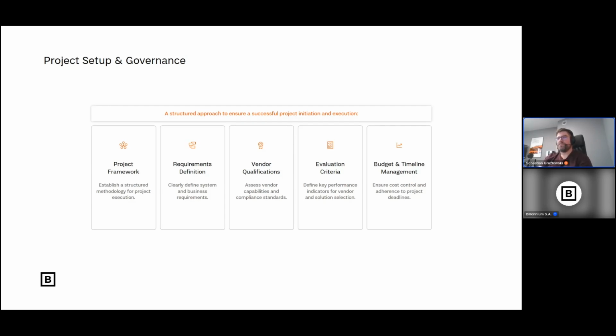When you are assessing your vendor, your system, you need to think about your evaluation criteria, because the evaluation will be different for your lab personnel and for your IT team. Your lab personnel may like that it looks great on a tablet, the fonts are nice, and the workflow is really good. But your IT personnel will be more interested in the technology stack, how the system is installed, how many additional layers of architecture you will need to support.